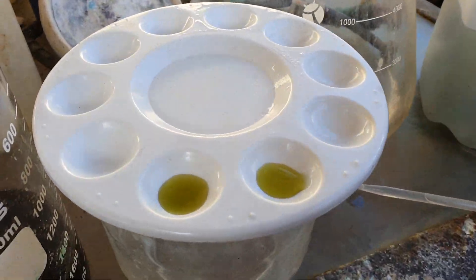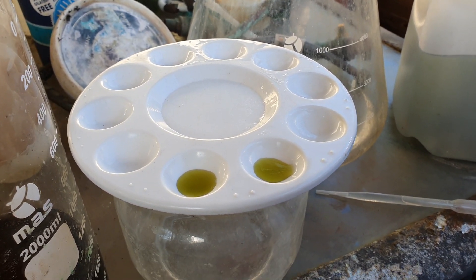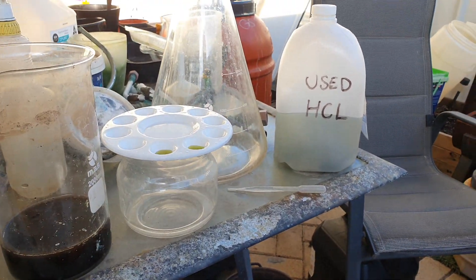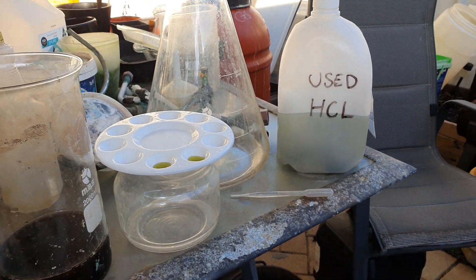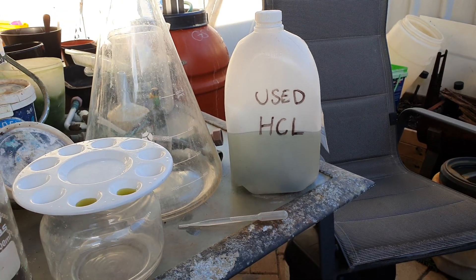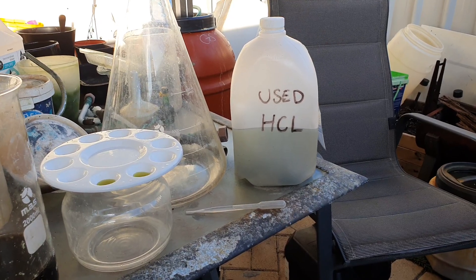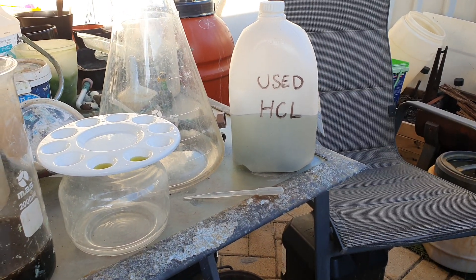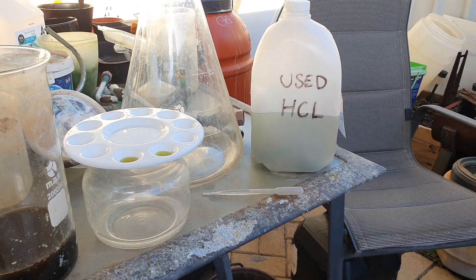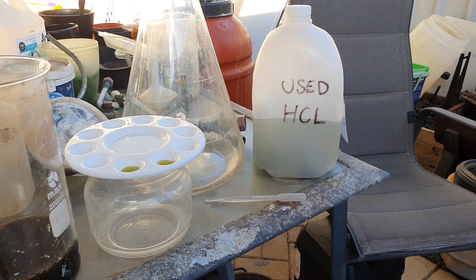G'day viewers, welcome back to another video. This is going to be a quick one. One of my viewers asked me if used HCL that has been used to dissolve tin and solder from circuit boards would be exactly the same thing as stannous chloride. The answer, as far as I can tell, is yes — it is exactly the same thing.